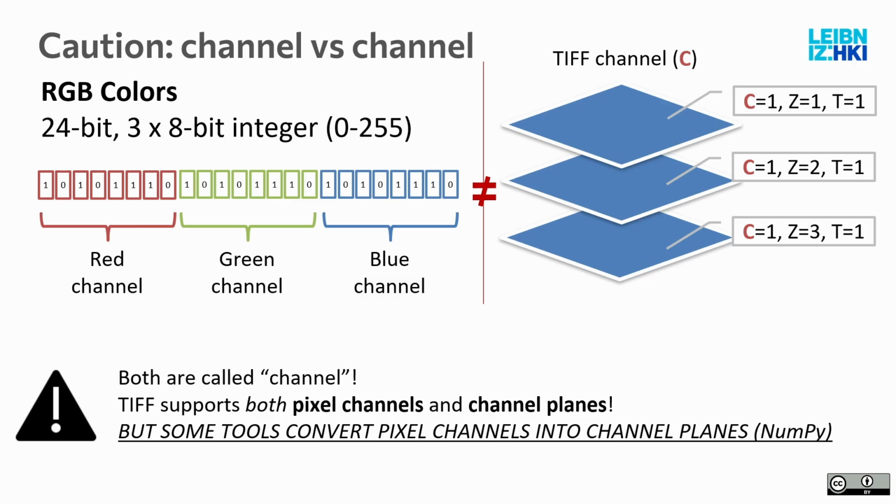Python especially can handle either. So if you give it the RGB, it will convert it internally in some way. And if it gets both, then it will do something, so you get these weird things. ImageJ, fortunately, can handle this. ImageJ can handle a TIFF that is RGB colored and has multiple channels and a Z axis and a time axis, absolutely fine. When you're working with Python, be careful with those. Very careful. OME-TIFF is also a thing. It's a bit weird how they handle these things.